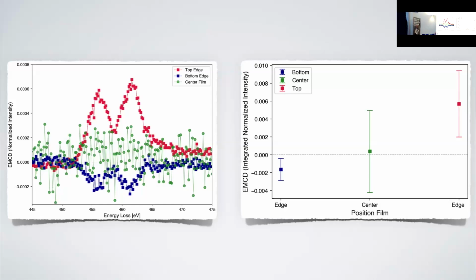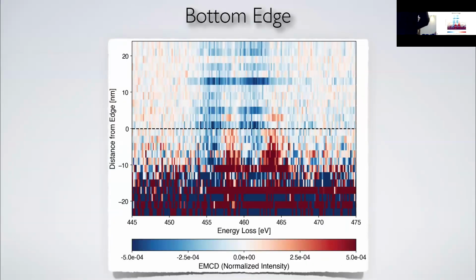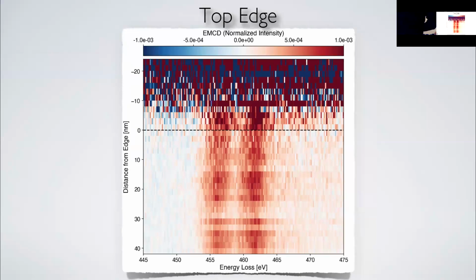All right. Do you have a sense of, is there a good way to calculate how far those need to be away, or did you just do it? Orbital diffusion bond length. It is believed to be 3 nanometers. So up to 3 or 4 nanometers, the orbital signal should decay. But as you can see in our data, if I go back, we have orbital signal that is like 40 nanometers into the sample. And then it could be even larger.